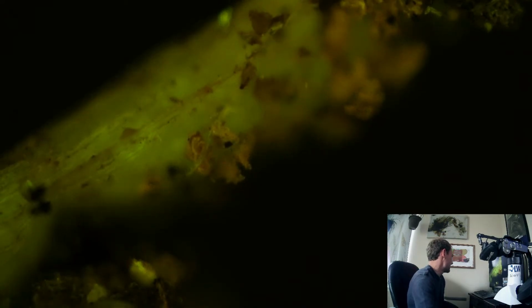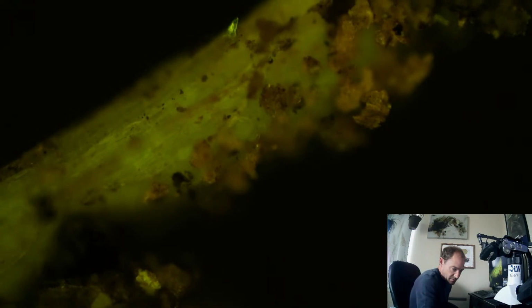Let's get into better focus over here. We're getting to the edge. I think this root's rising up a little bit. There we go. Dialed into focus. Oh yeah, right there in the middle. Am I going to bump into this root if I go into 400x? Yeah, let's go in to 400. Oh, yep, I bumped into it a little bit. Yeah, let's go back out. Am I still going to bump into this thing? There we go. Now we're in at 400x.